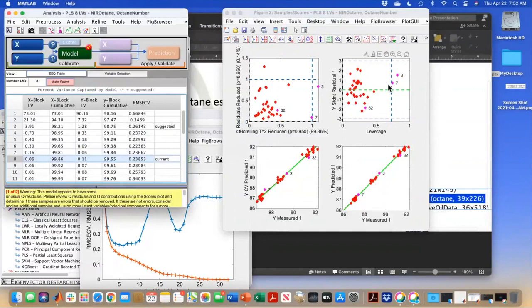So it makes sense that these two are both out. You'll notice that it looks like we've done a little bit better on number 32. However, in cross-validation, it's about the same. It didn't really change that much. But in fit, it did change. So we're starting to capture a little bit of nuances, maybe even noise in our data to try to explain that kind of thing.